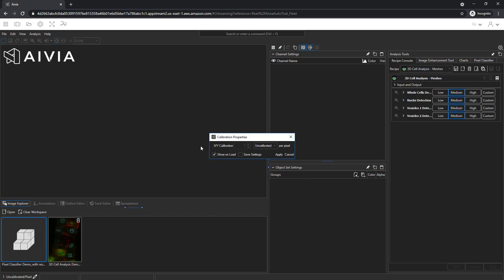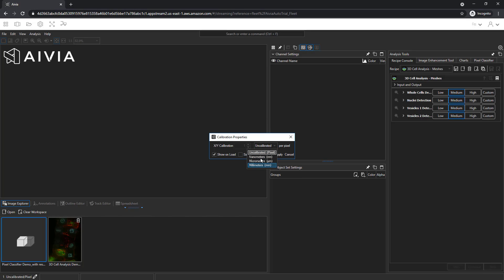The calibration pop-up will appear. You can use the drop-down menu to specify the units and calibration. If you do not know it, leave it as is and click Apply.